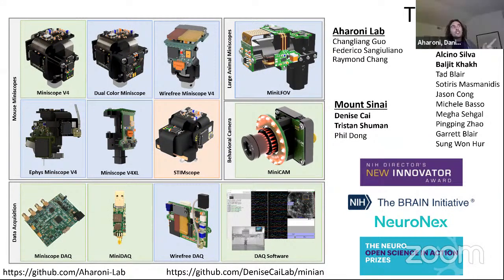Yeah, so the older generation Miniscopes were 3.3 grams, and our newer version 4 Miniscope is 2.6 grams. That's the large field of view electrotunable lens setup. Especially for songbirds or juvenile mice, you would want to go potentially even lighter. We have a design that's 0.8 grams, a miniature microscope with some of the electronics offloaded to a little backpack for a songbird, that we haven't finished building.